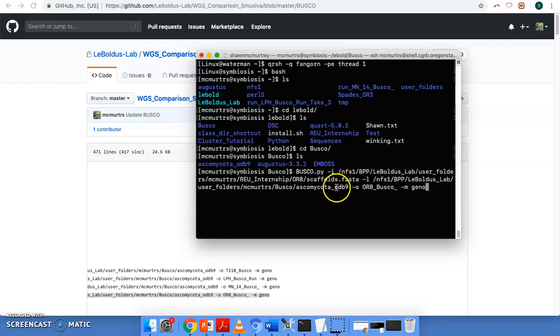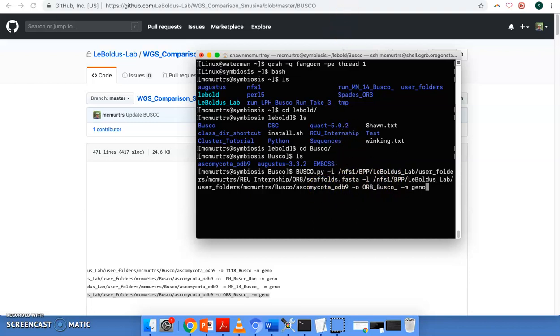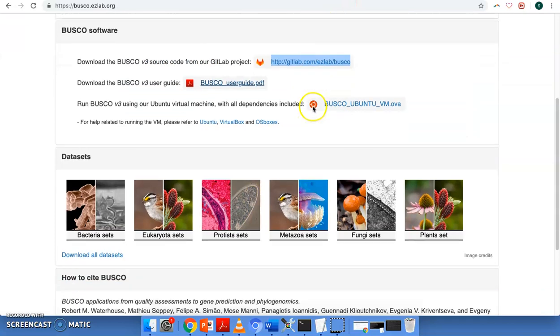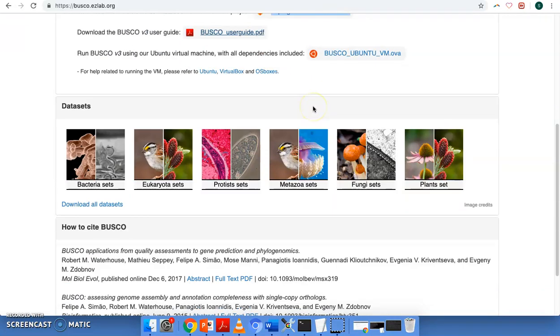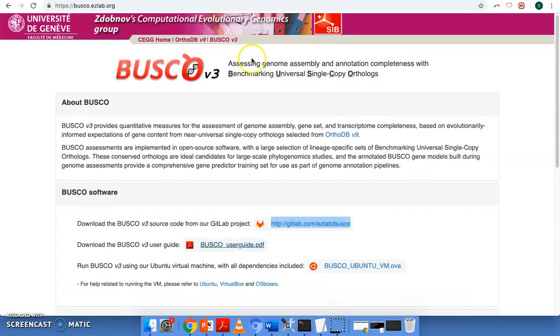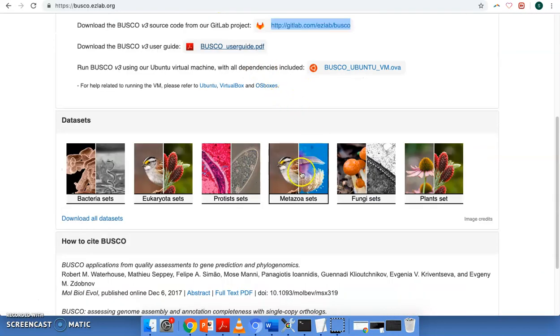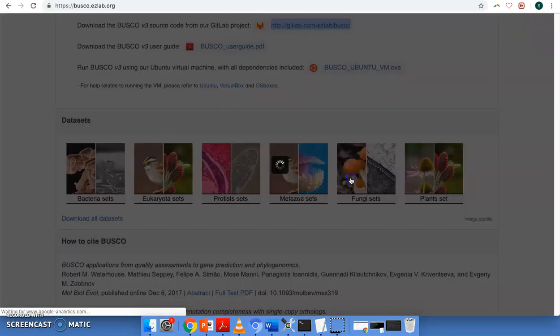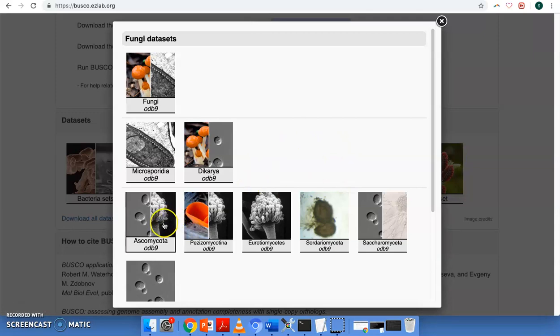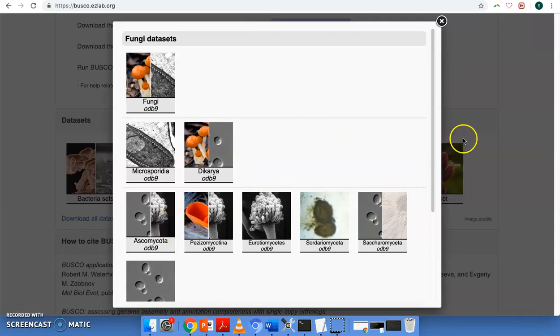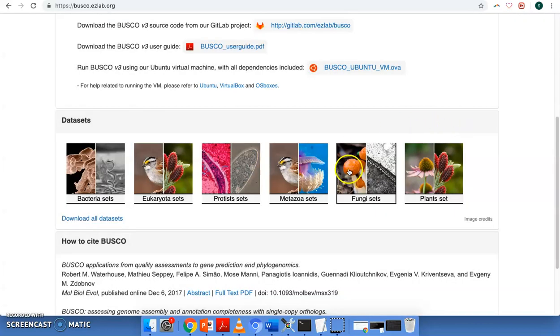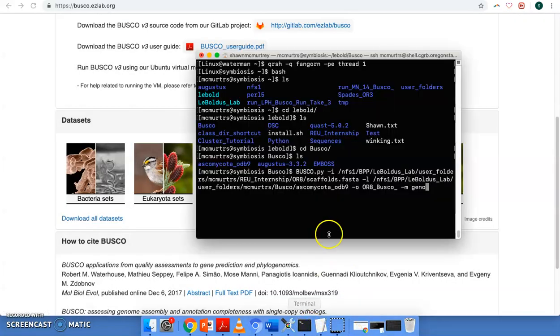This is the folder of the datasets that we need for busco. And it can be downloaded at their website here. For our particular scenario, we're doing S masiva. So we did fungi and then ascomycota, because it's an ascomyc. So that's the dataset we're comparing our genome against.